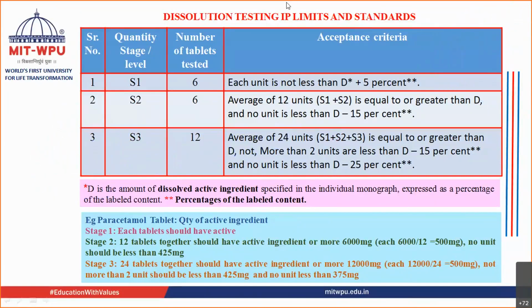So once again, in order to carry out the procedure, you take the tablet and put it inside the vessel, or inside the basket. You start your machine. Once you start your machine, after some time, we are assuming that the drug is getting released from it.